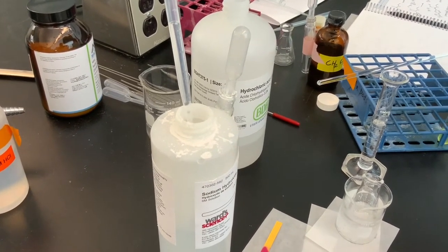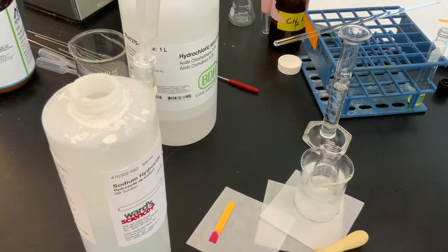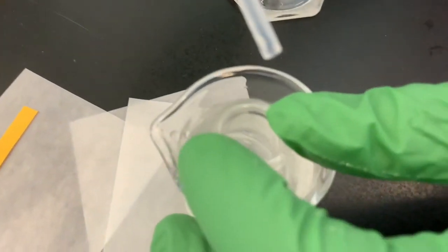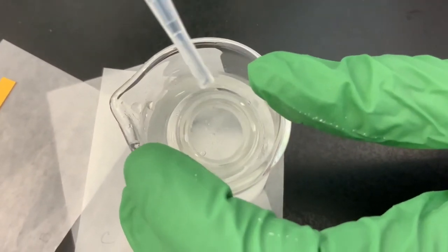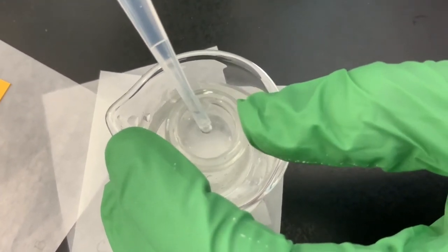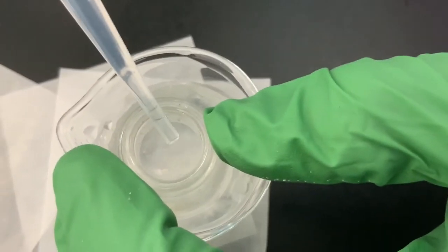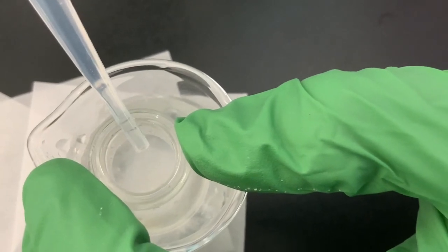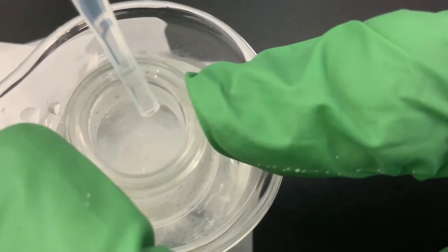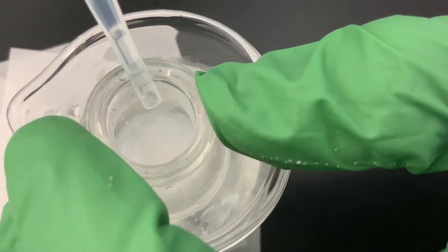And when we add the sodium hydroxide, we're aiming for a pH of around 5 to neutral pH of 7. So don't confuse the ice for solid just yet, but we should see that as we add the sodium hydroxide, our benzocaine should precipitate, right? Because we are neutralizing the acidic conditions, and as a result, we are freebasing. You can sort of see that already, even just with one drop. See, now it's even more visible. As it drops, that white material that's sort of falling and then being pushed away, right? That should be our benzocaine precipitating out of solution.